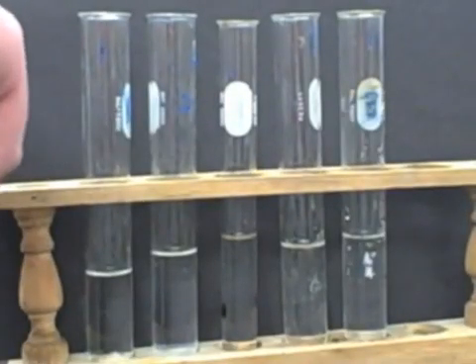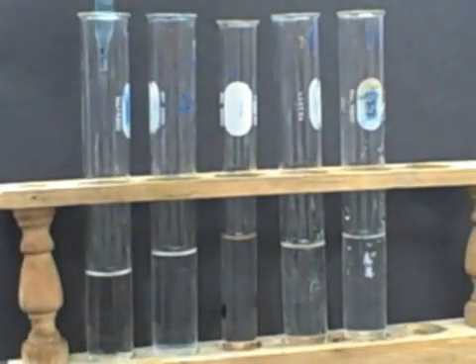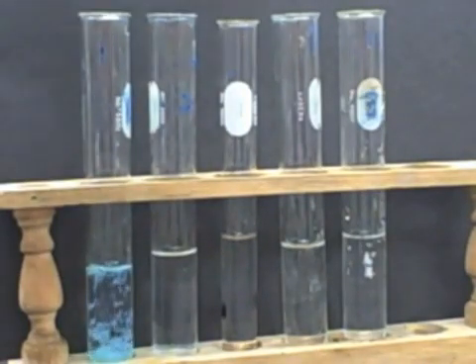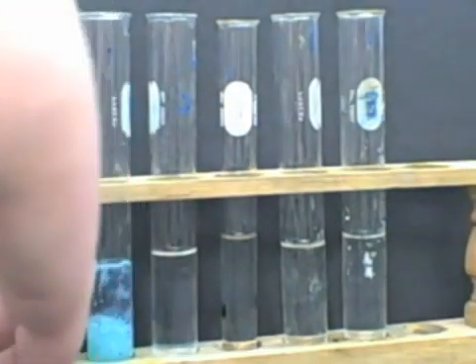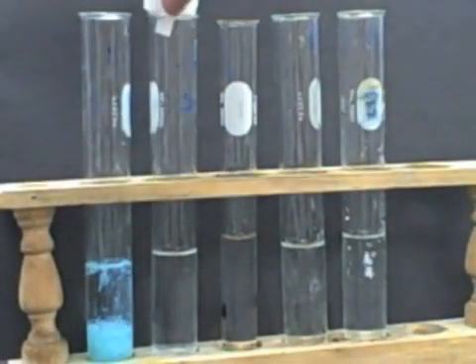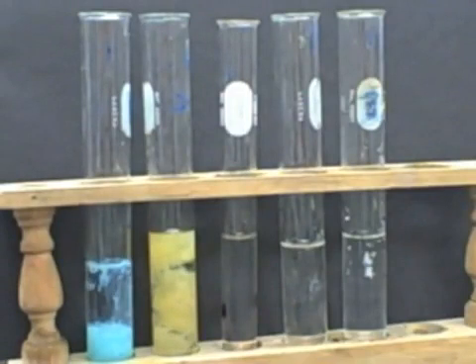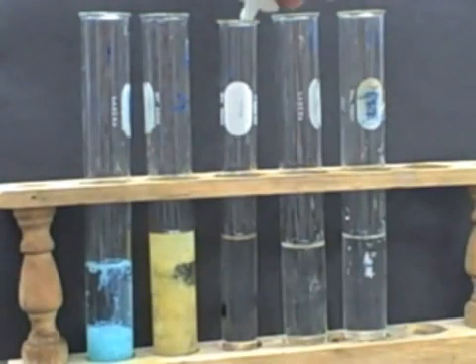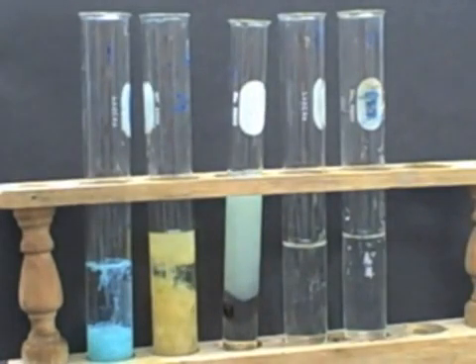So now we're doing phosphates, and these are actually pretty original. There's not many of those up on YouTube. This is copper phosphate. You can see it slowly being precipitated out. It's a more greenish color than the others. Iron phosphate, so this is iron chloride and sodium phosphate. Wow, yellowish color there. That's a great color. Nickel phosphate, so nickel chloride and sodium phosphate. Bluish color there. Bluish green.